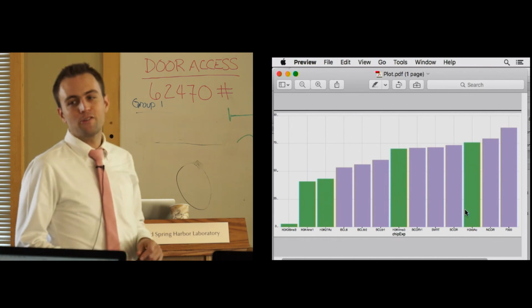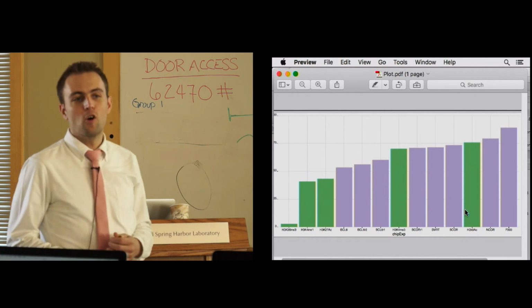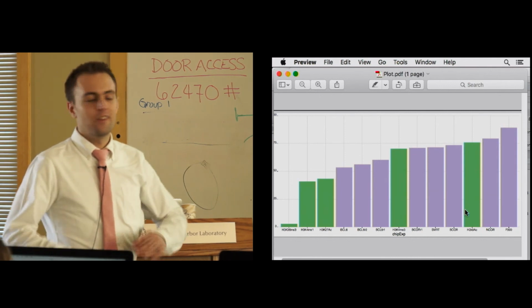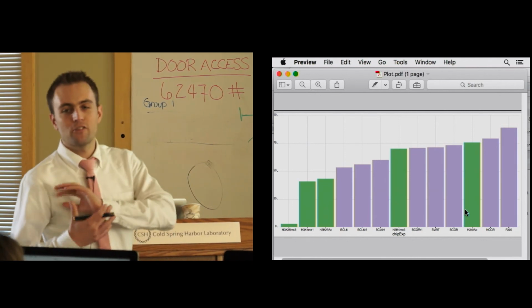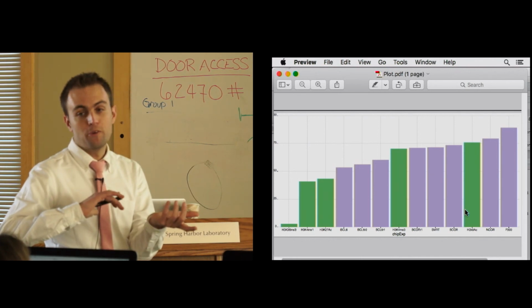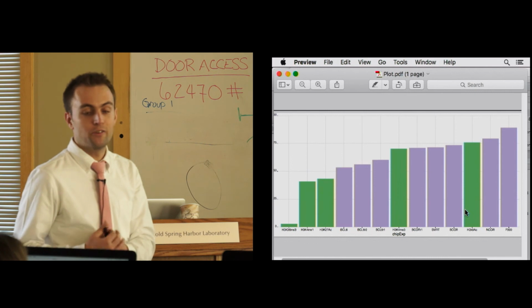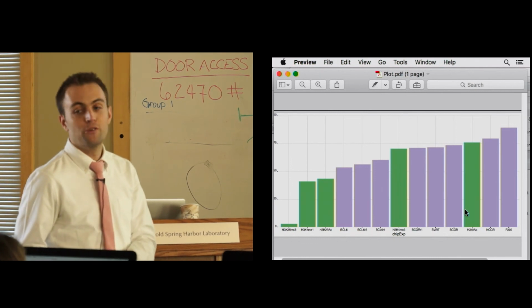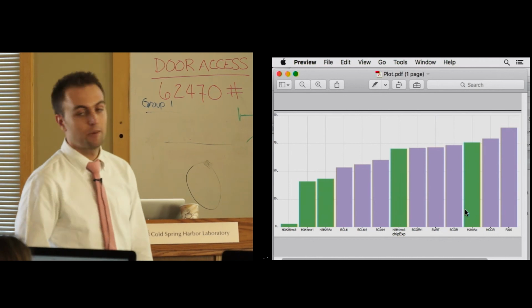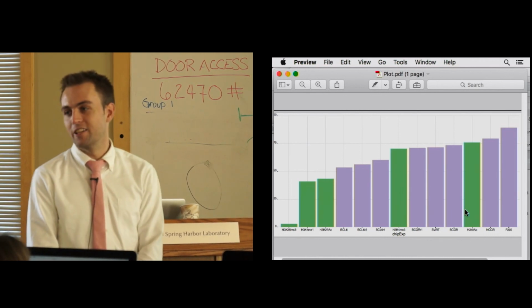So yeah, this is giving us the overlaps, and in a way this is getting to this point in the analysis. I sort of looked at what the reverse is. If we were using whole genome sequencing, we'd probably see more in some of these, but we'd probably see really high overlap too.